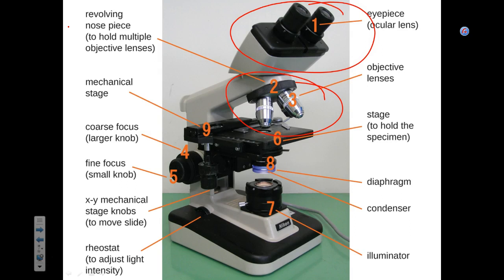They're still too small. You will see them, though, using the low power objective. You will see tiny dots. Yes, that's bacteria. But you're not going to see anything sizable. If it's more than a dot, like a period in a book, no. When you go to high power, the 40x objective, the 400 magnification, the blue one, that's when you start to see actual cells. You can sort of figure out the shape and stuff. They're still going to be small.